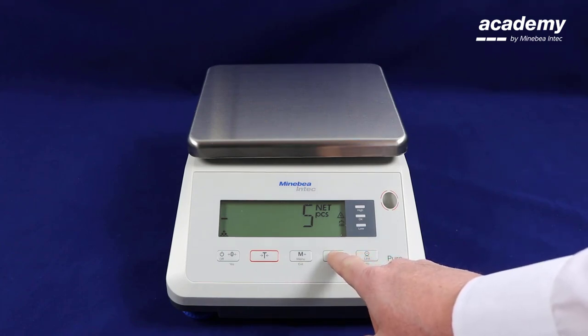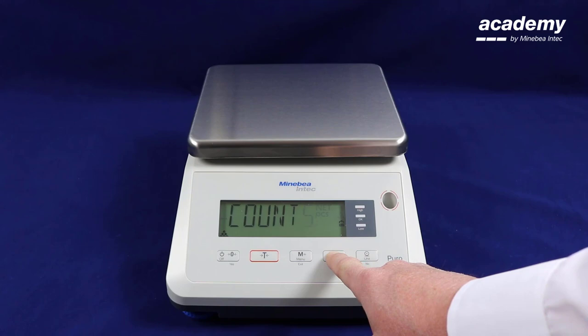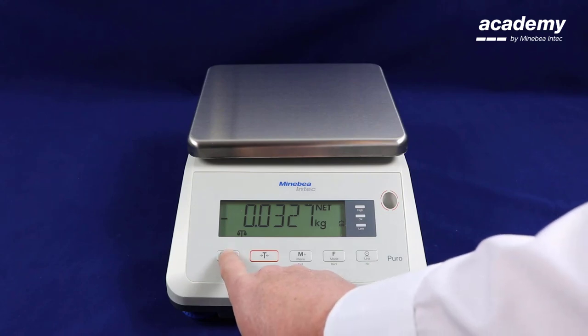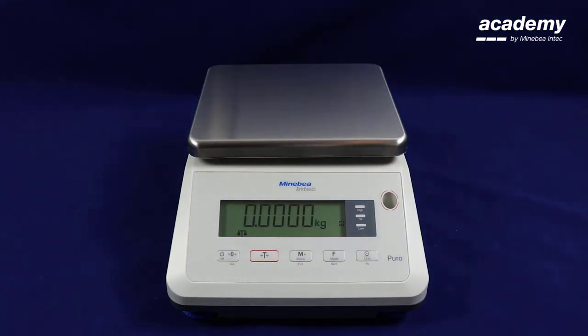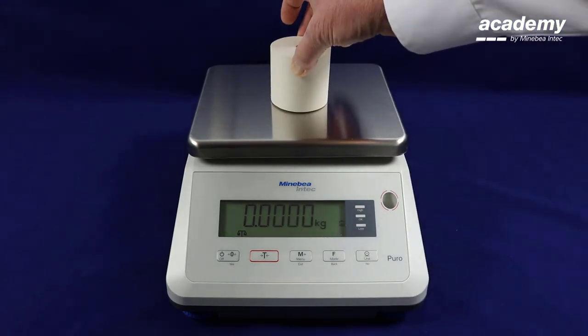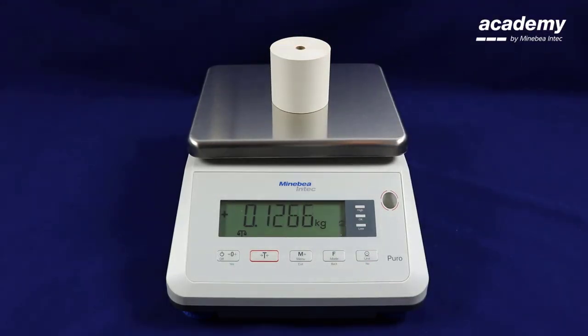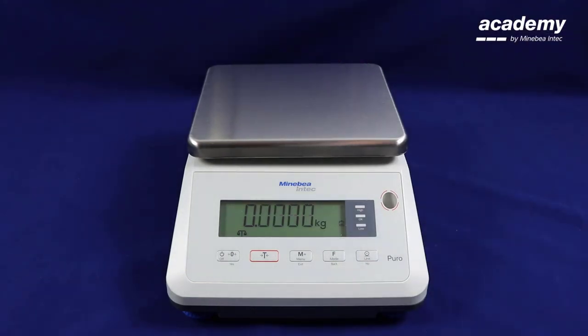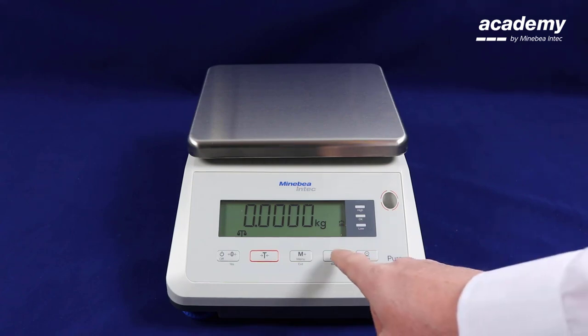By pressing and holding the function key and releasing when weight is displayed on the screen, the scale is now for use in its basic function. As demonstrated and shown on the screen by the small symbol, these are weighing scales.